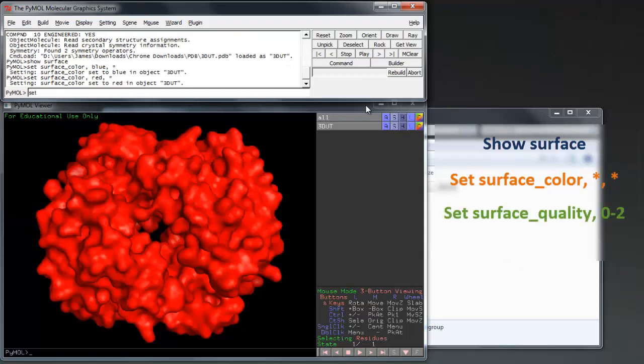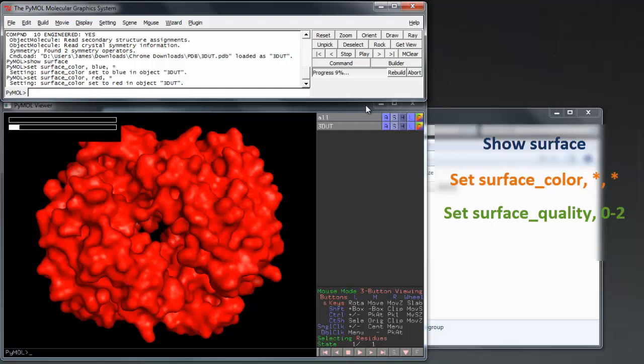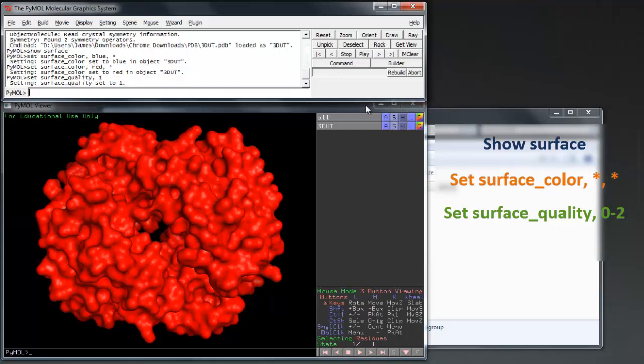Improve the quality of the surface by set surface quality 0 to 2. I recommend 1 unless you have a very powerful PC, as there is little difference between 1 and 2 as shown on the screen.